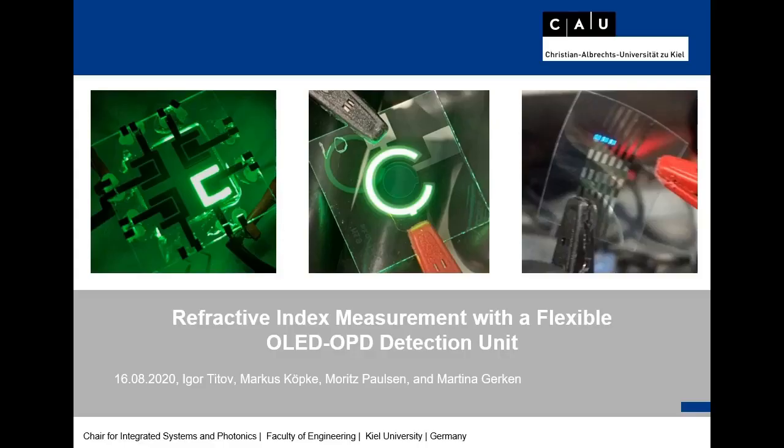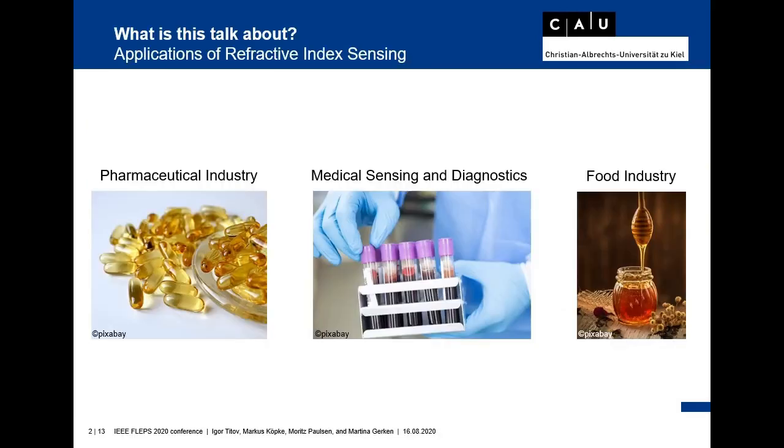So my talk today is about refractive index measurement with a flexible OLED-OPD detection unit. Let's start with the fact that the refractive index has a large number of applications. It is mostly applied to identify a particular substance, confirm its purity, or measure its concentration.